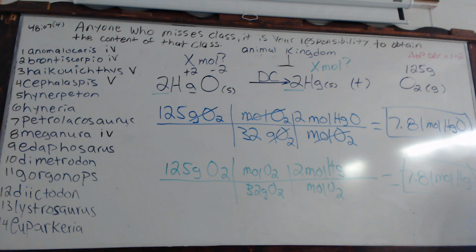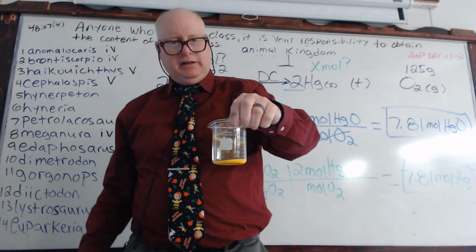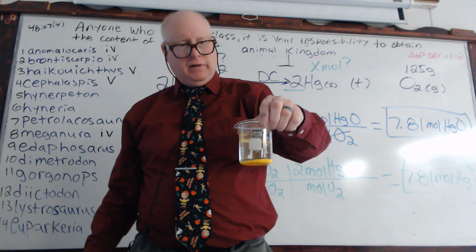Look at what we have here. See, it precipitated back out again. We got a clear solution on top and a precipitate on the bottom, because we had just shown this earlier. It was nice and cloudy.